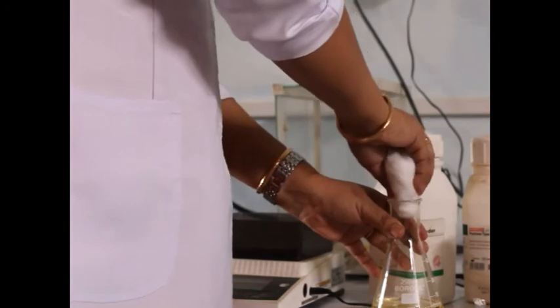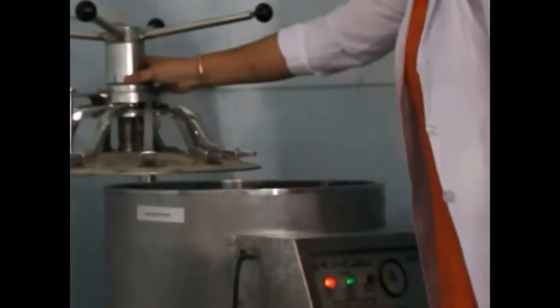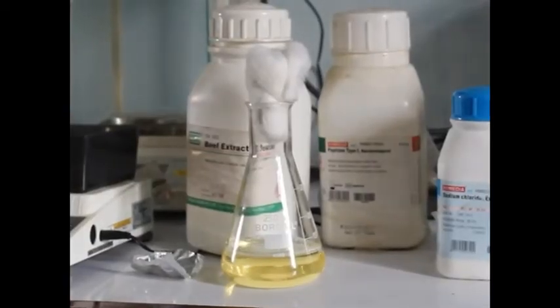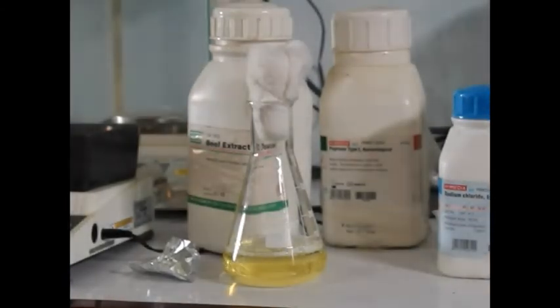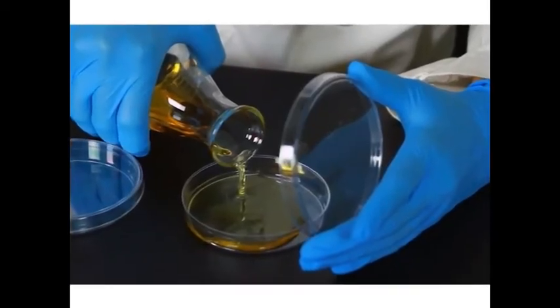Then the flask is sealed by the use of cotton plugs. Then the medium is autoclaved at 121 degrees Celsius for 15 minutes at 15 pounds of pressure. After autoclaving, the medium is allowed to cool to approximately 45 degrees Celsius, but it should not be solidified. This nutrient agar medium is poured onto the sterile Petri plate and allowed to solidify.